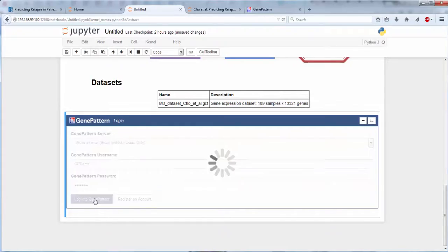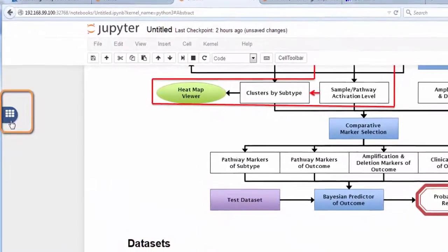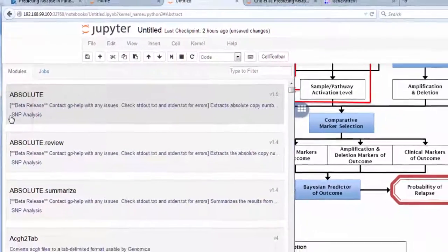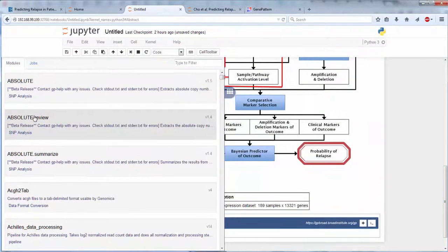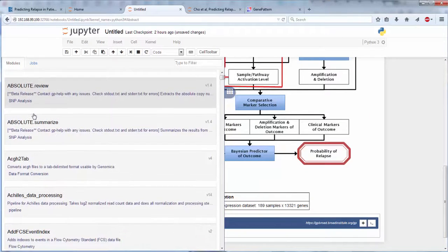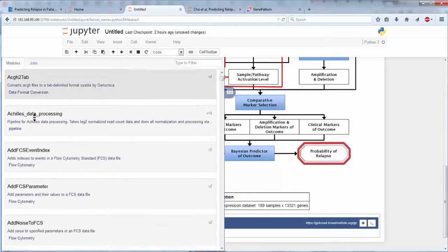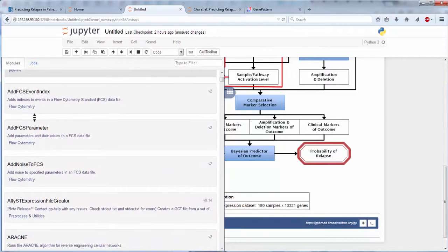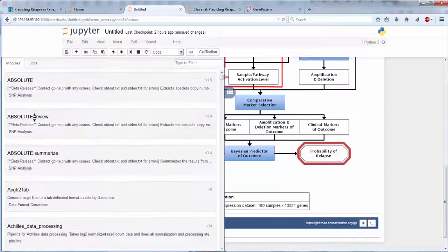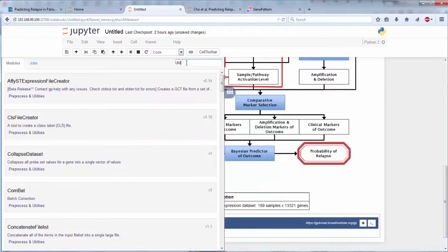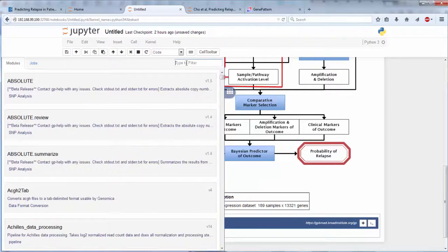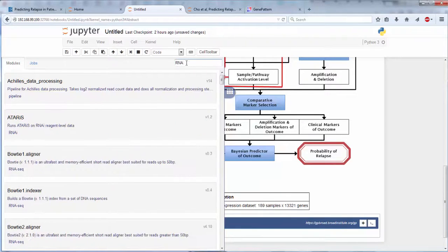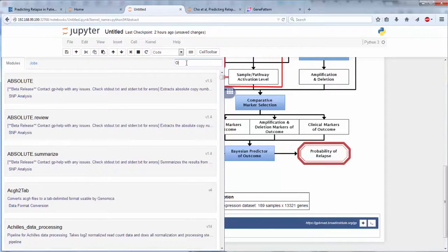Now we will add a GenePattern analysis module to our notebook by clicking the GenePattern button on the left of the screen, and choosing one of the available analyses on the server to which we have connected. You can browse all of the available modules by scrolling through the alphabetized list, or you can search for modules by category, keyword, or name.